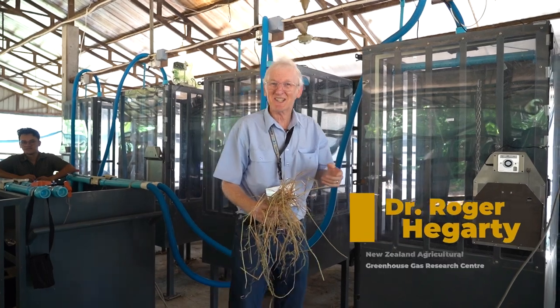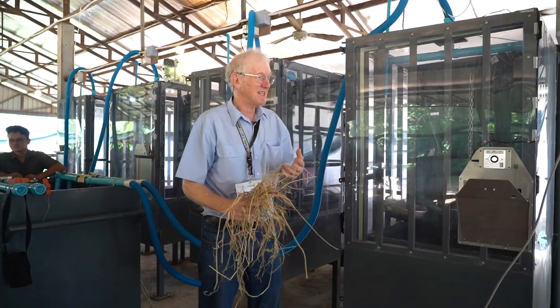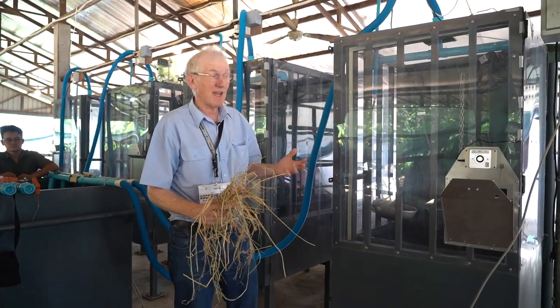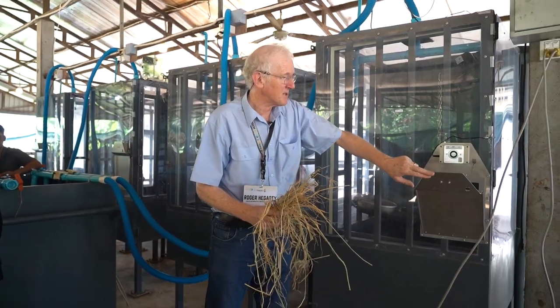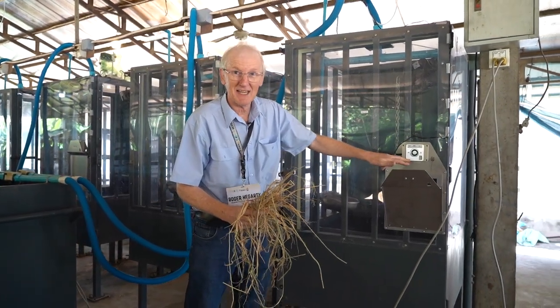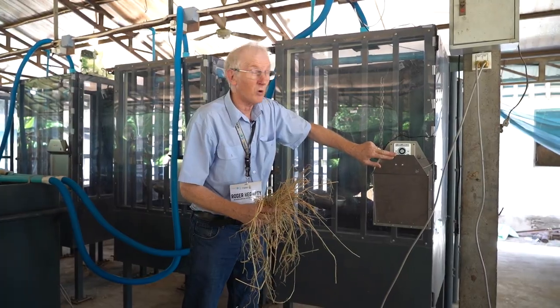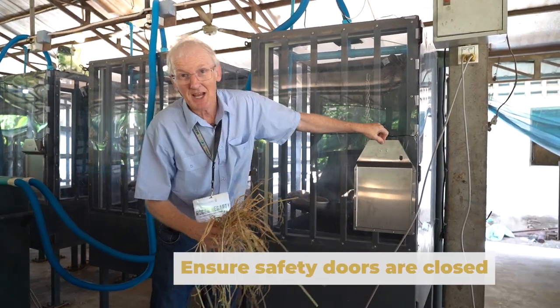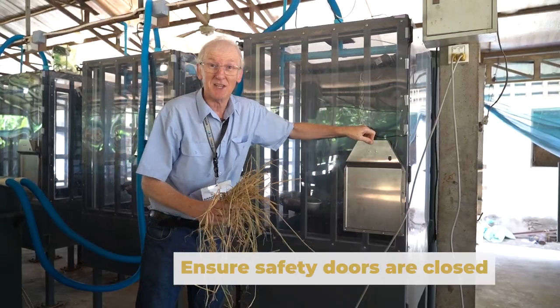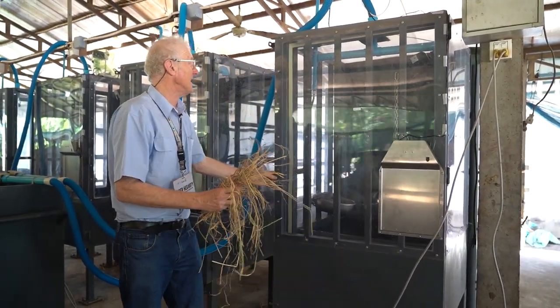Let's move on to the second step, which is understanding the flow system. Let's get ready as if we have a cow coming into the chamber. First thing we do is make sure the safety door, an electromagnetic switch that opens if the power stops or if the CO2 level gets too high, is closed. So we close that up, and now no power on earth is going to undo that until the electricity goes off. So the door is shut.